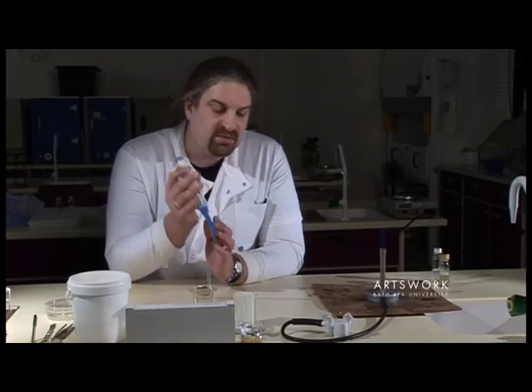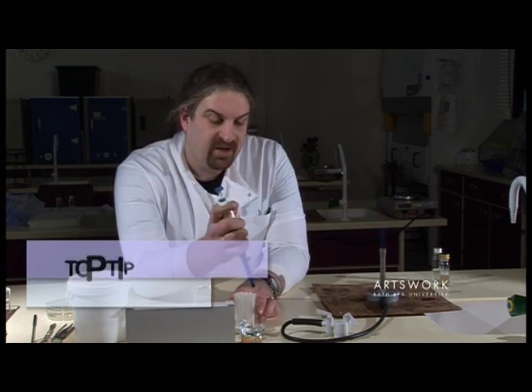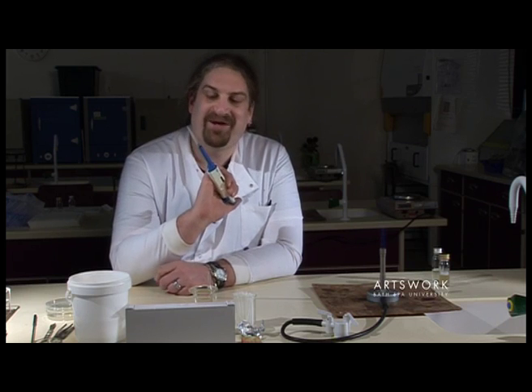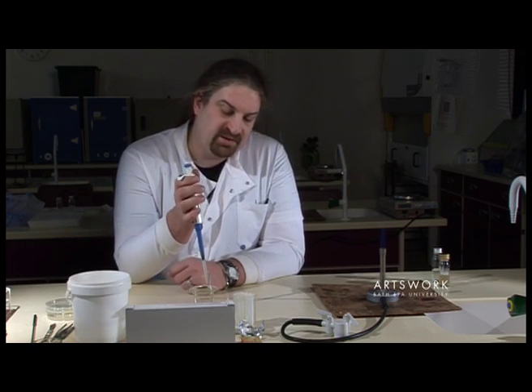A couple of housekeeping points: once you put your sterile tip on, make sure that you keep your pipette pointing downwards. If you have your tip and sample and you're holding the pipette horizontally, the liquid sample will just run into the barrel. Also make sure you don't touch anything with the pipette tip — don't put it down on the bench, don't let it catch your clothing. Only put the pipette tip on when you're ready to transfer your sterile sample.